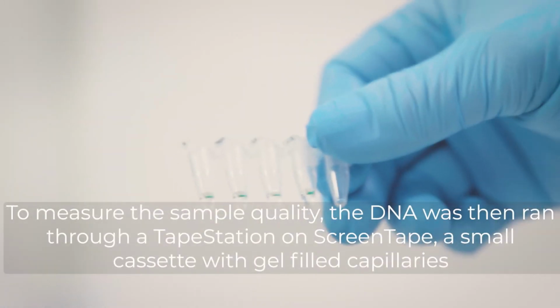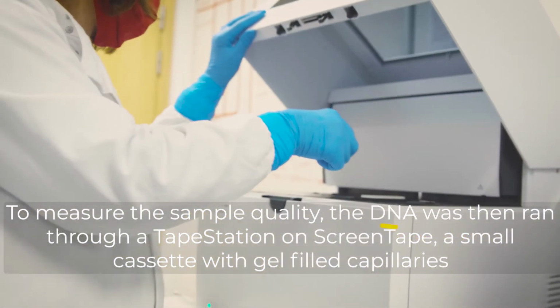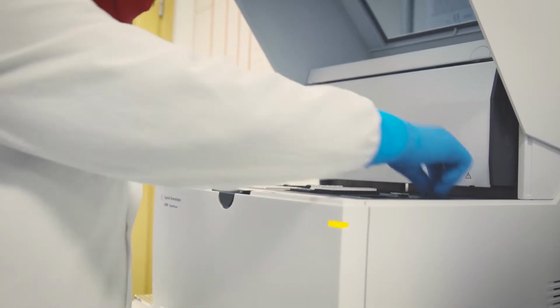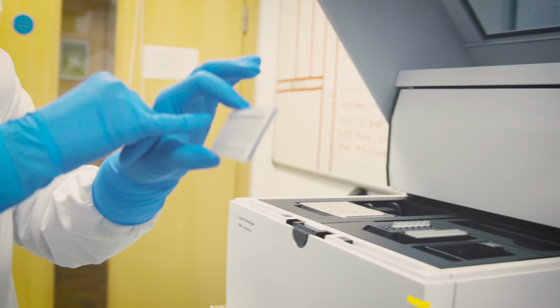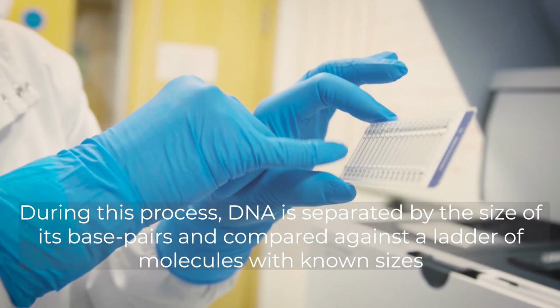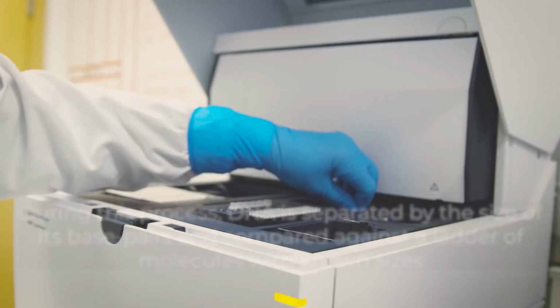To measure the sample quality, the DNA was then run through a TapeStation on ScreenTape, a small cassette with gel-filled capillaries. During this process, DNA is separated by the size of its base pairs and compared against a ladder of molecules with known sizes.